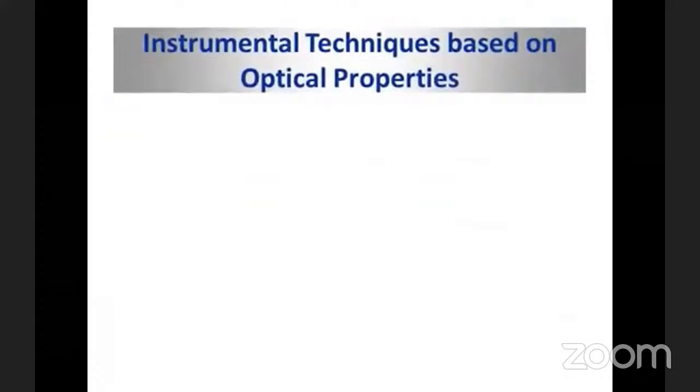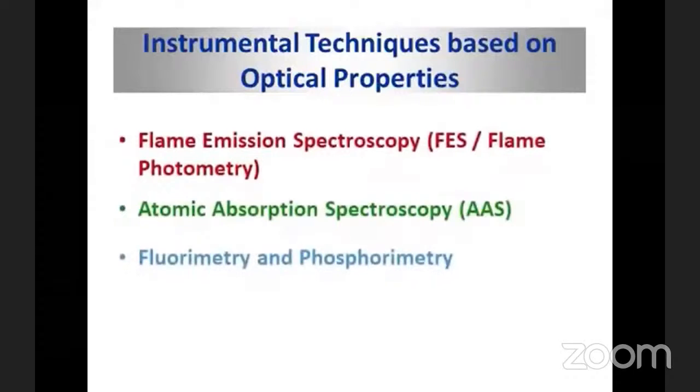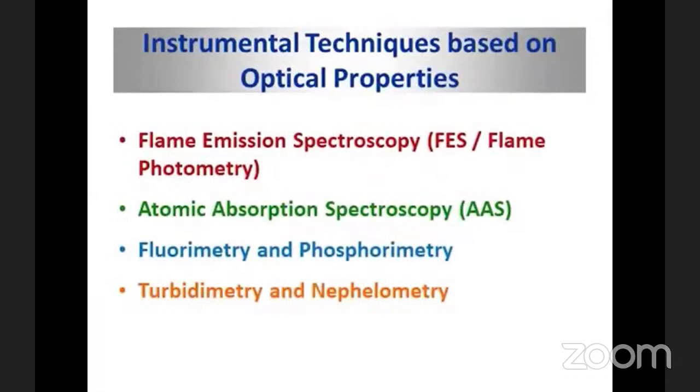So herein we are going to discuss some important instrumental techniques based on optical properties, namely flame emission spectroscopy, which is called flame photometry. Second, atomic absorption spectroscopy.